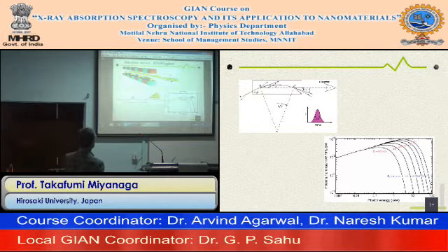The second one is the insertion device, abbreviated IDs. This type is the wigglers. With the bending magnet, one set of magnets is set here, but with a wiggler there are similar magnets alternatively located, and electrons go like that.